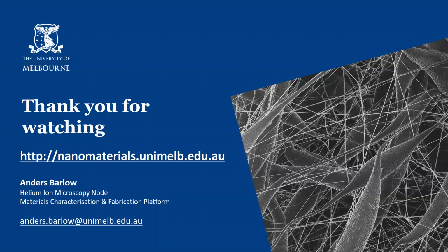Is milling done at a tilted angle in helium ion or like in FibSem? Okay, so this, I guess, depends on the system. If we're talking about helium and neon milling, then no, we're doing that normal to the surface. So you can, for example, if you're doing the neon milling, so you're removing as much as you can, you're doing that top down, and you can image with the neon beam. It's not great, but you can image.